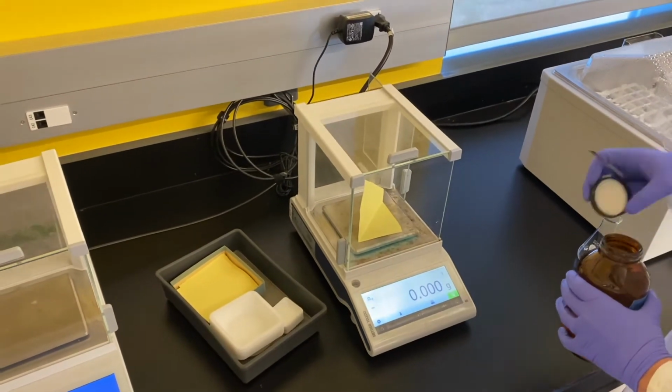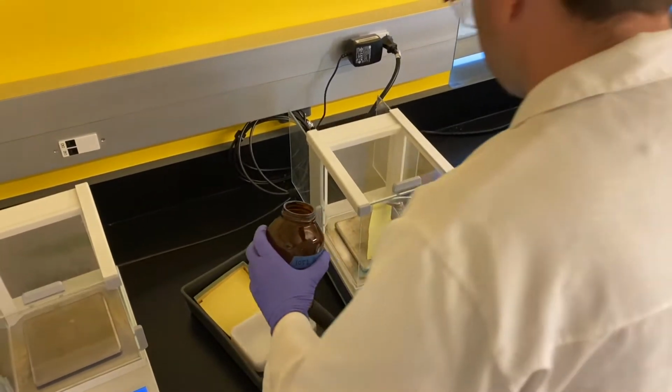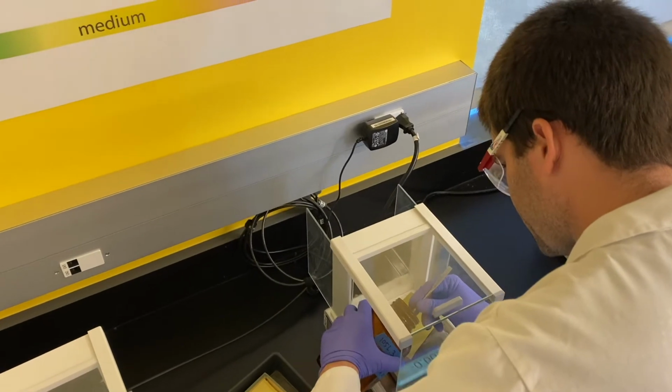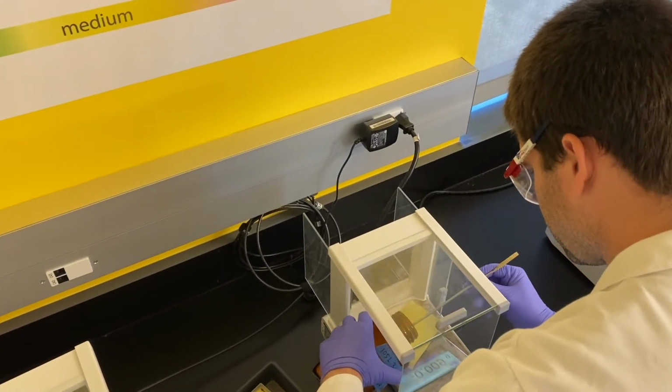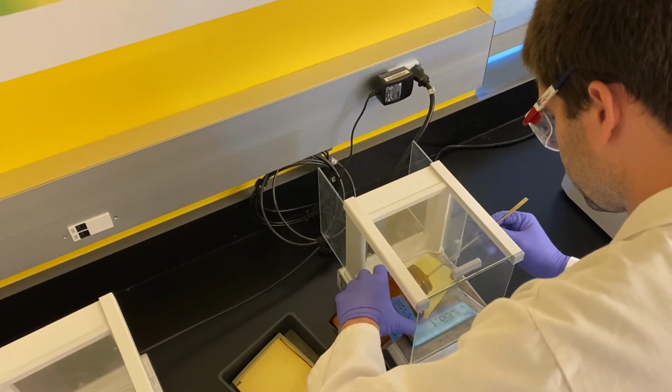And remember, when you're using a balance, always remember you want to zero it out. It's also called taring. Just make sure before you add any of your chemicals, the balance says 0, so all the mass you see is coming from the sample that you added.